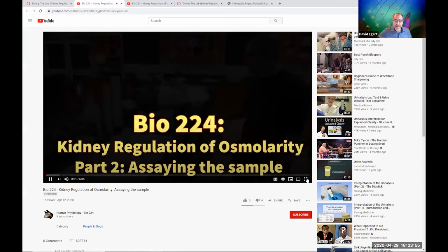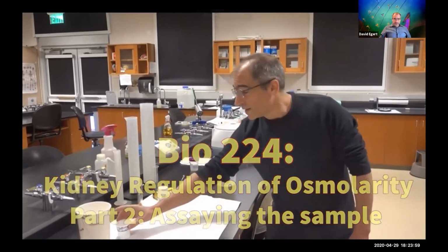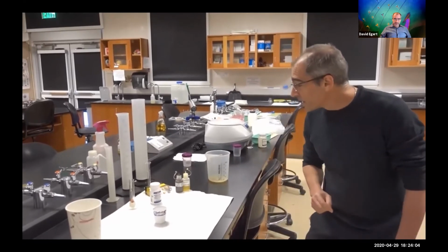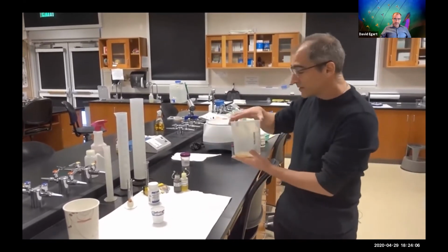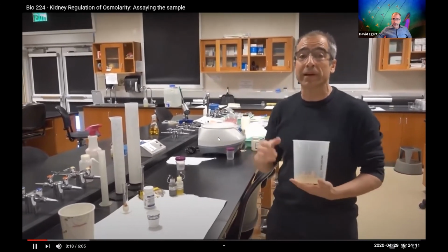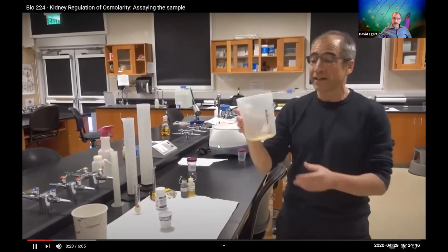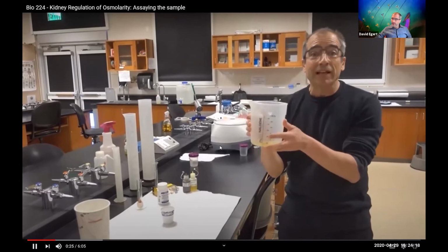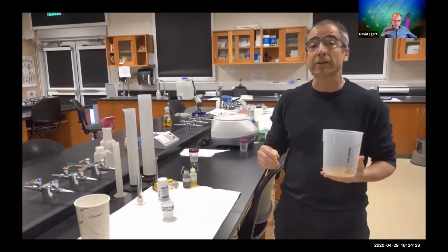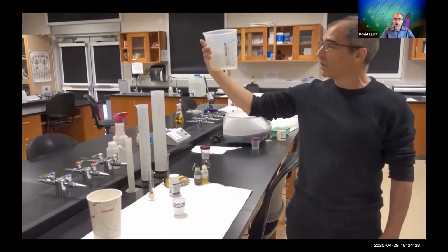All right, so I've been in group 3, which was just drinking 80 mils of water and taking 1.5 grams of salt. And this is a half hour after I did my initial voiding of my bladder and taking my treatment. And here's the amount of urine that I've got. Again, I'm collecting every last drop because I care about the volume. So this is not a clean catch like you were doing in the urinalysis lab. You're going to collect from the beginning to the end of the flow.